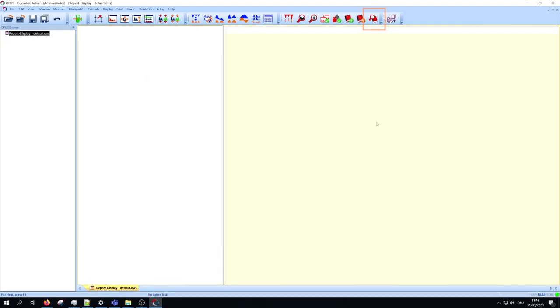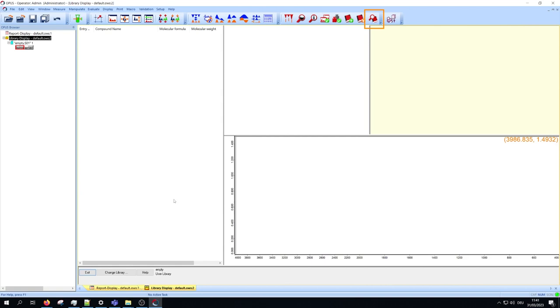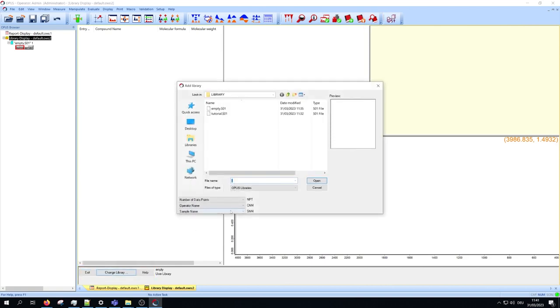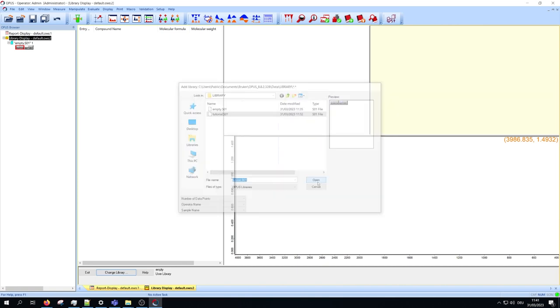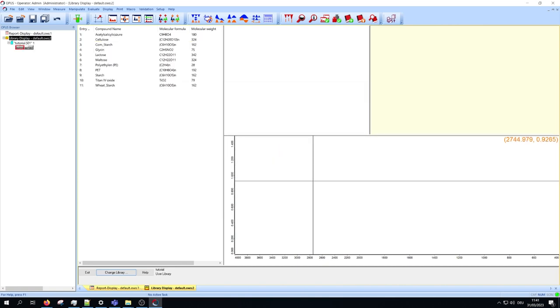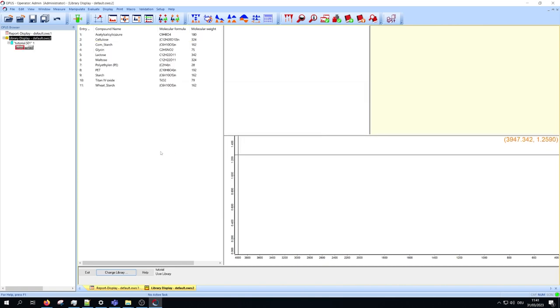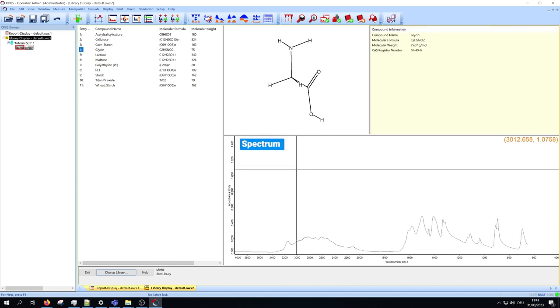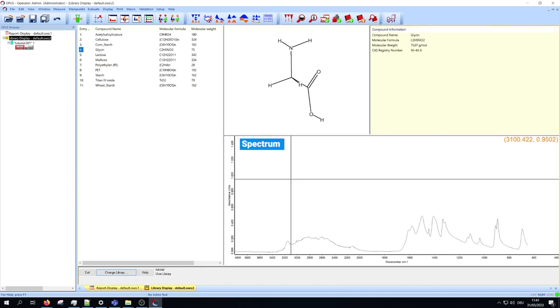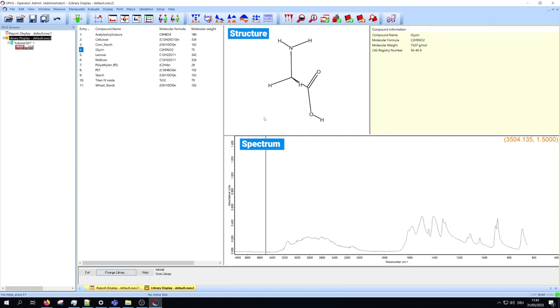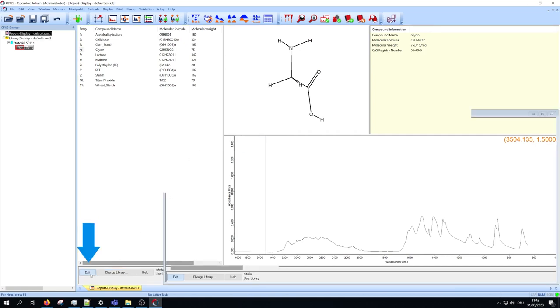Via the browse library function and the change library button at the bottom, you can search your libraries. Open your created library. You see now all entries you added with the information you entered, the spectrum, and if attached, the structure. You can close the library via exit.